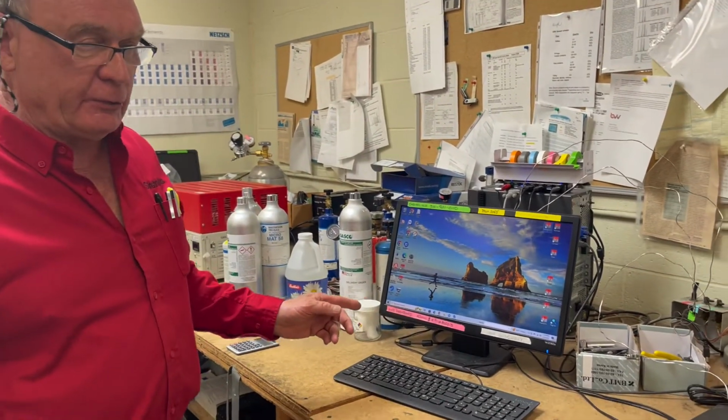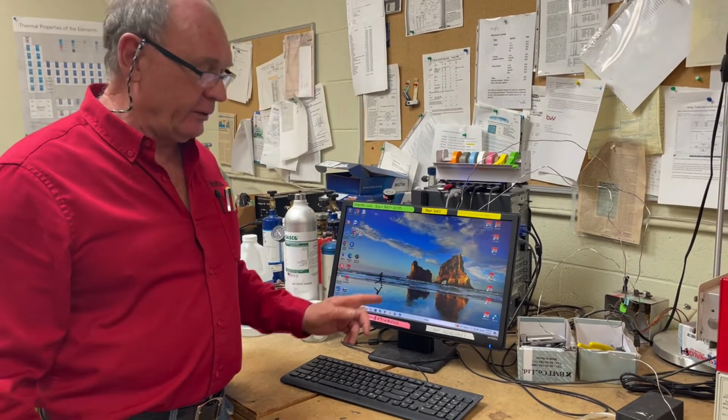Hi, I'm Hugh from SRI, and in this video we're going to show you how to do the Autosampler queue, or introduce you to the Autosampler queue.